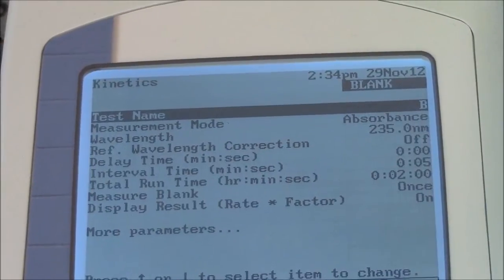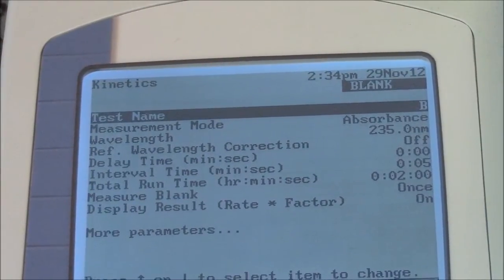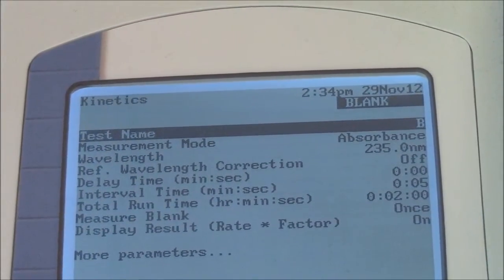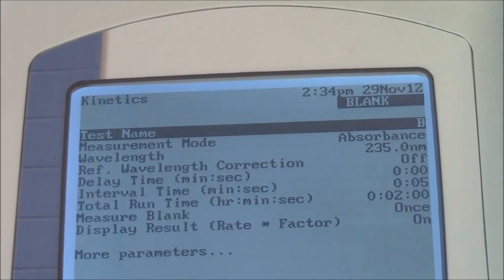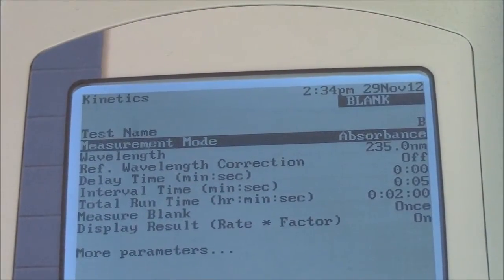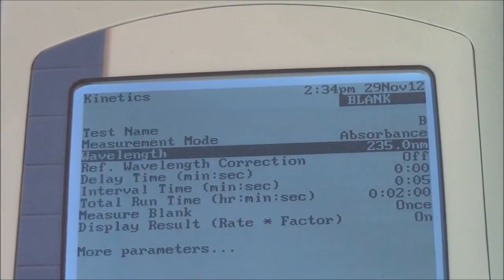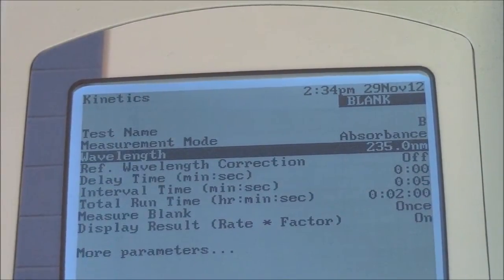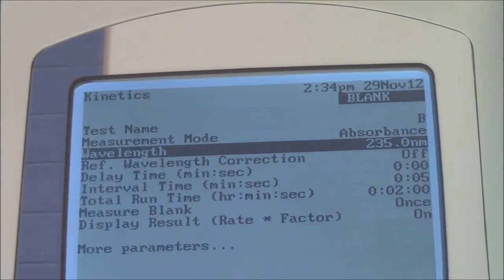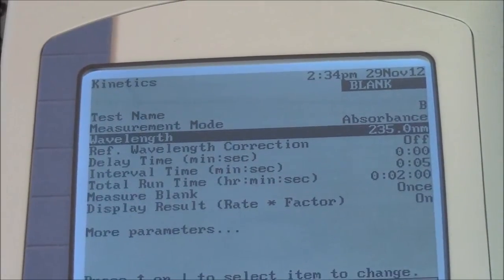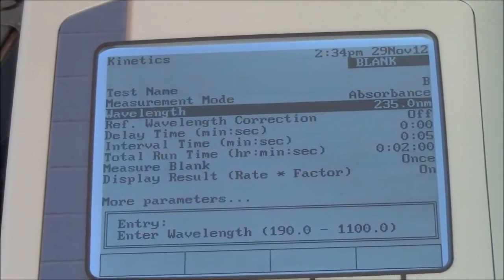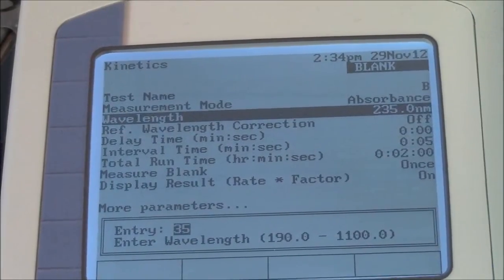Now there are many choices. Many of them you just leave the same. You could name your test. Absorbance is the correct measurement mode. For the enzyme assay, this needs to be 235 nanometers. You just type in a number. So if I wanted to change the wavelength, I'd type in a number — 350.